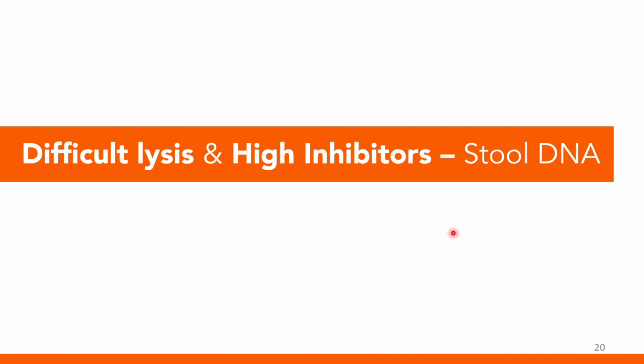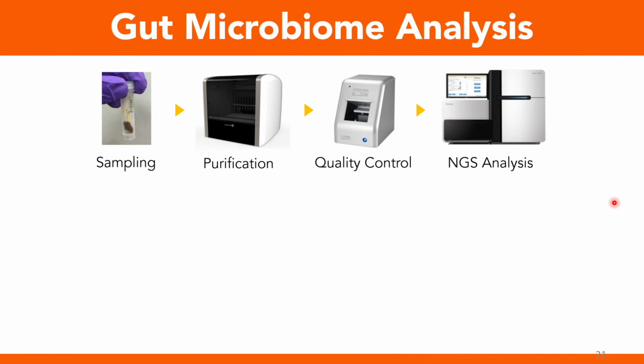Okay, so that's the second part of my presentation, and now we move to the third part about difficult lysis and high inhibitor samples, which is stool DNA. Actually, we purify stool DNA to study gut microbiome analysis. We do microbiome analysis actually.